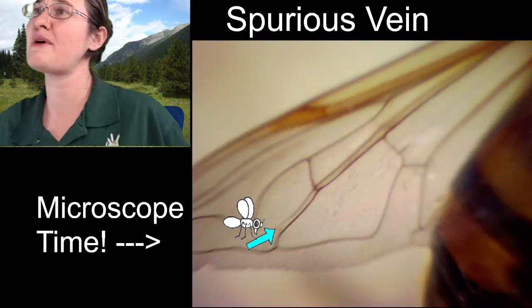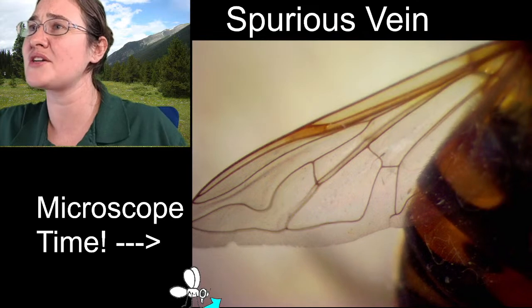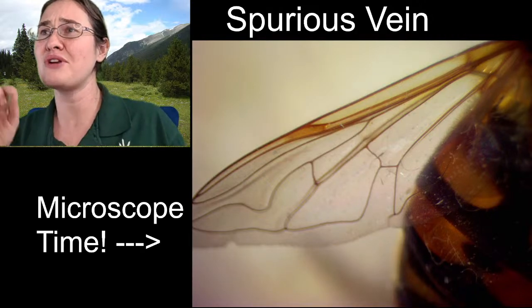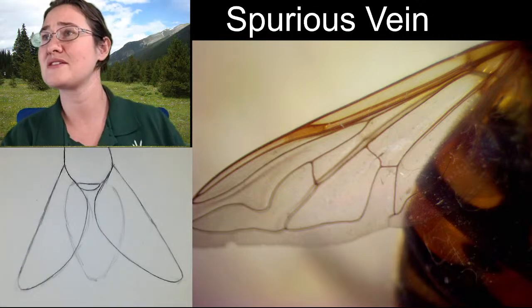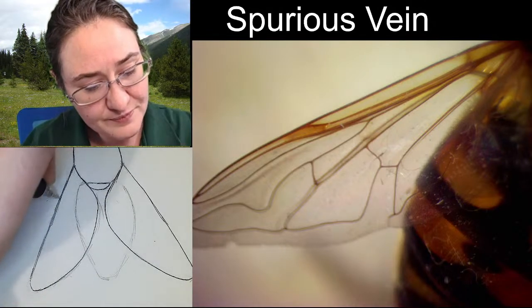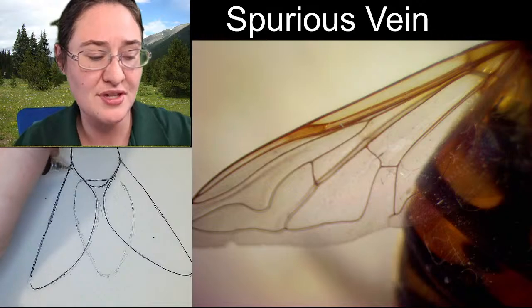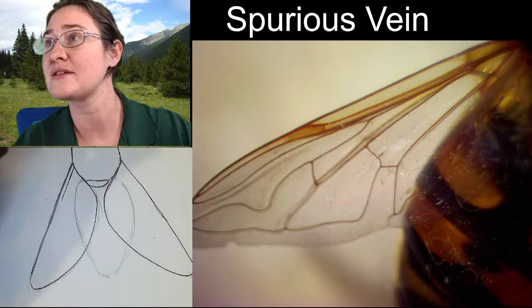So I'm going to zoom back out so that we can see the entirety of the wing vein. And I'm just going to walk us through sketching these veins, but I don't have all of the names of these veins memorized. I do know that this top vein here is called the costa. It's nice and dark. It's a leading vein. It's going to be the strongest one. Then you have the subcosta. That's this dark one that runs parallel at the base.